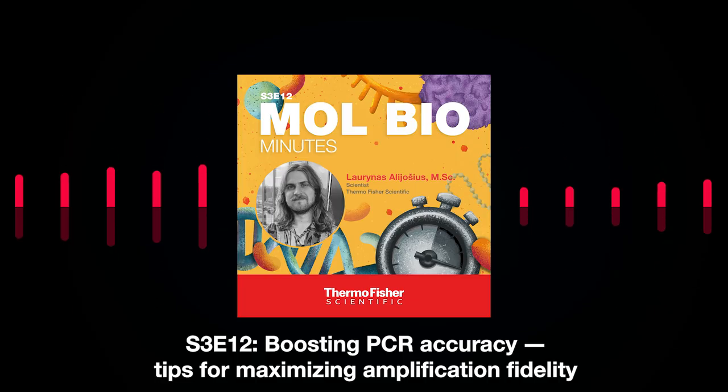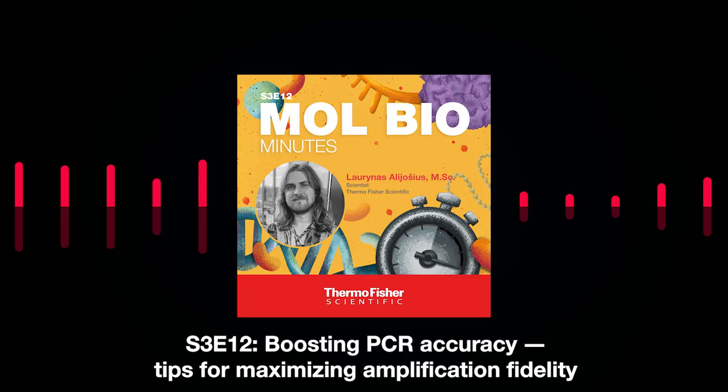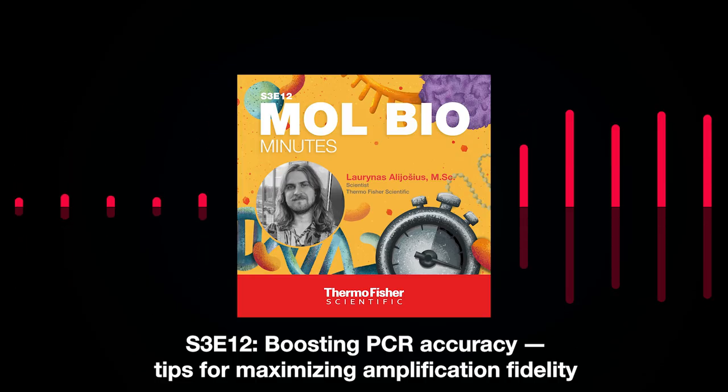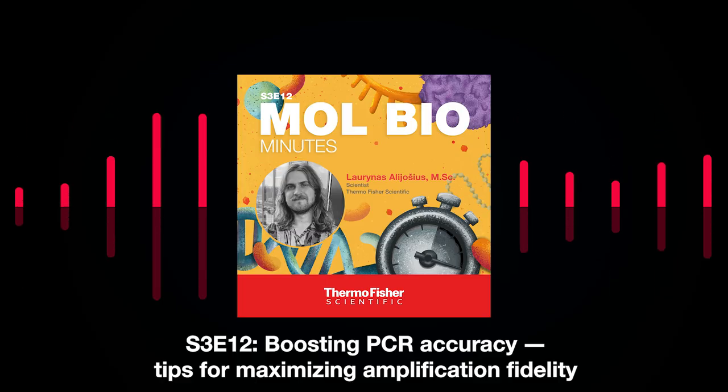So that could mess up your general PCR results pool, or let's say if your DNA template is modified or degraded. For example, if you use DNA from the FFPE samples, that stands for the formalin fixed paraffin embedded samples, DNA originating from the FFPE, for example, tends to be degraded in a way, so that can cause some problems.